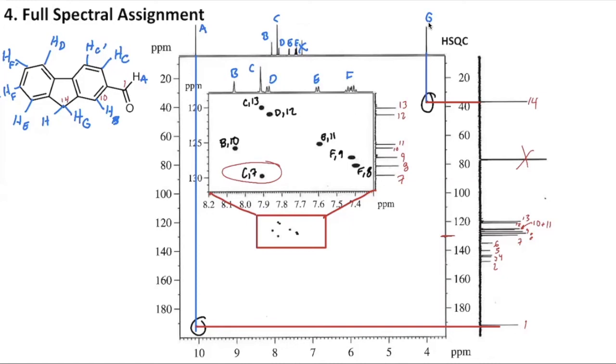So between C and C prime, I think we want to assign that carbon 7 to be right here next to our aldehyde group coming off of the benzene ring. Why is that? You can picture it with a resonance form. Now, unfortunately, we have the opposite resonance form of the benzene ring that I would like to demonstrate this, but I'll show you how both carbon 7 and 10 are going to be relatively withdrawn due to the nature of this electron withdrawing aldehyde. It is all due to resonance.